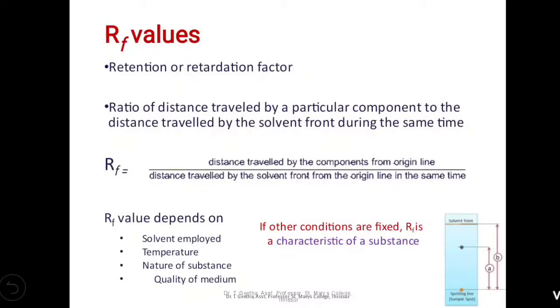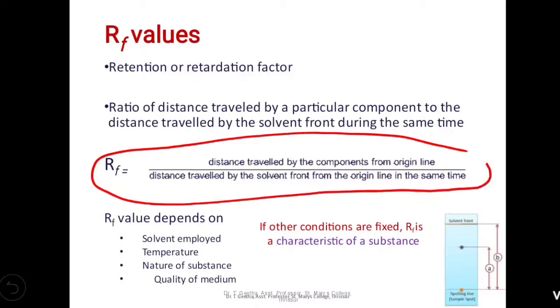The degree of retention of a particular component is expressed as the retention factor or retardation factor, RF. It is the ratio of the distance travelled by a particular component to the distance travelled by the solvent front during the same time. This is the RF value.